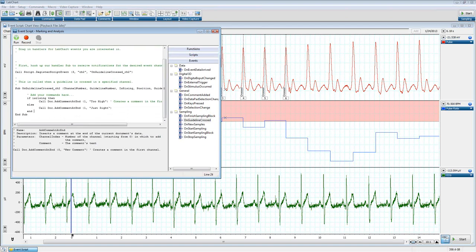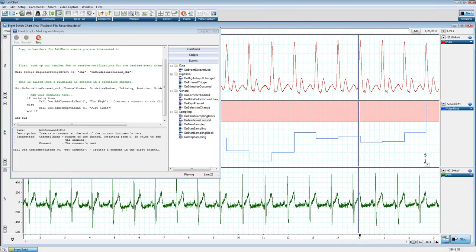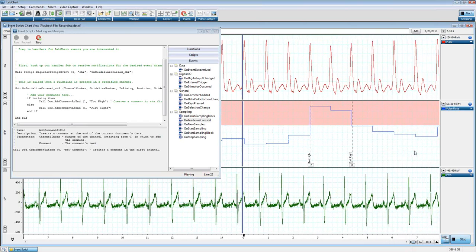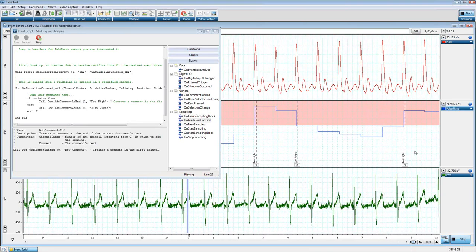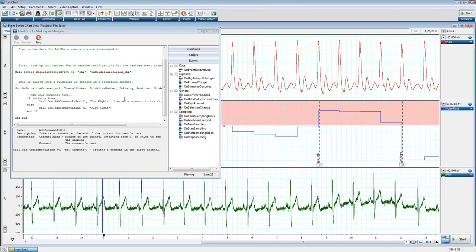And there is a simple routine that gives us the ability to separate the difference between rising above this guideline and going below this guideline. So now if I run my macro and click Start, you should see a difference between rising and falling. There's too high, there's just right. Too high. There's just right. Maybe a second. All right. So that's cool. So we separated that.